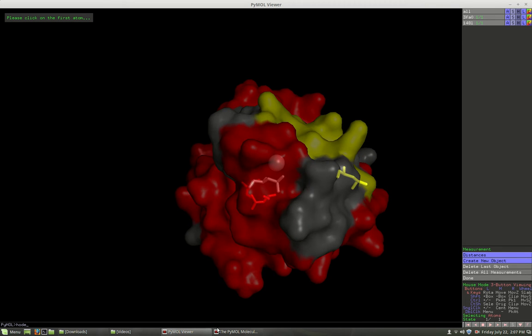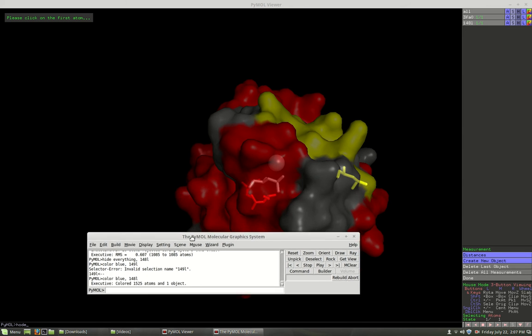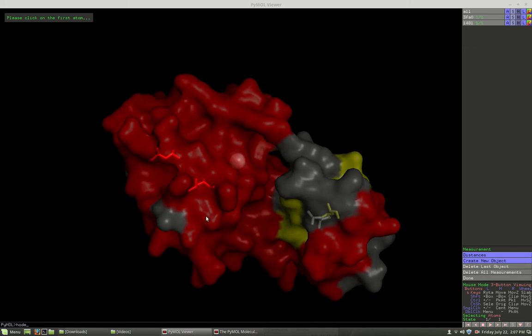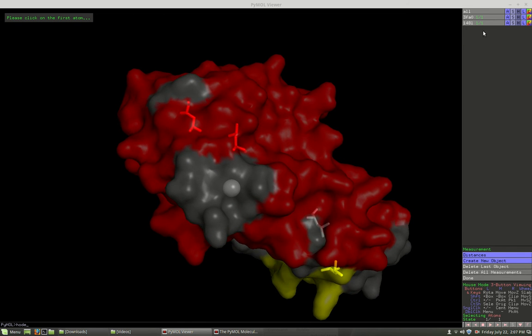Not sure that did anything. Try that one again. I put 149. There we go. Let's see. What did that do? You still don't see any of it. The other one is covering it up. Let me see here.